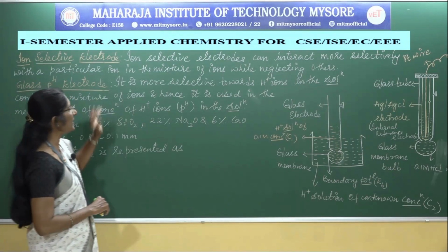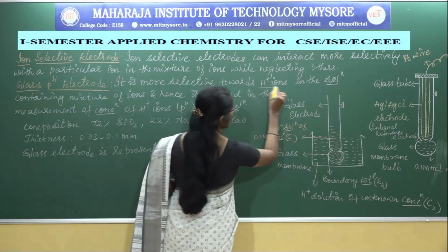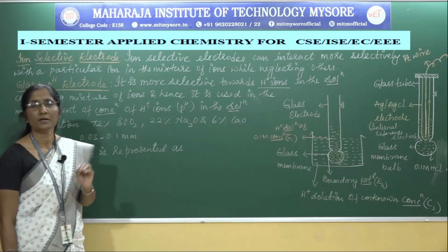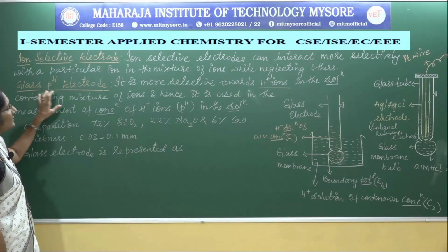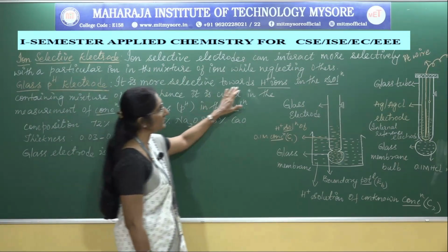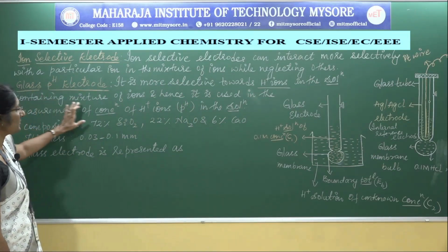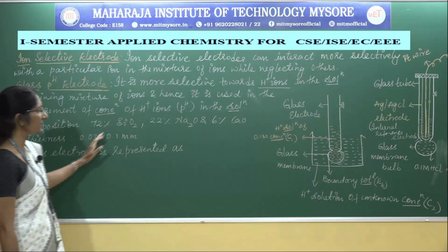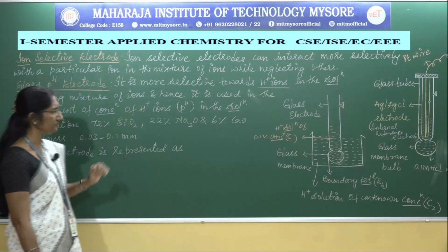This glass pH electrode is more selective towards H plus ions or pH. Therefore, these electrodes are used to measure the pH of a given solution, which is why they are known as glass pH electrodes. That means they are more selective towards H plus ions in a solution containing a mixture of ions. Hence, it is used in the measurement of the concentration of H plus ions and pH in the solution.